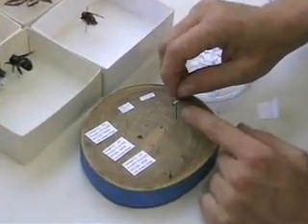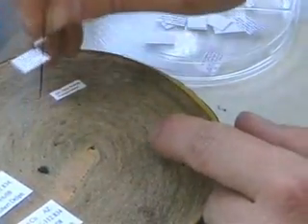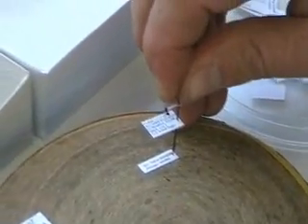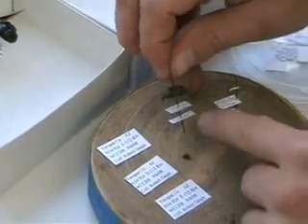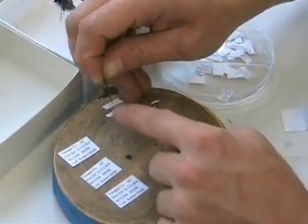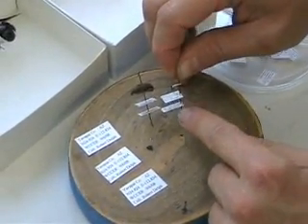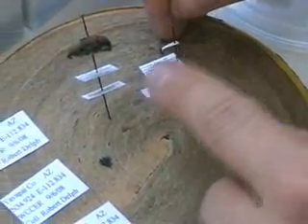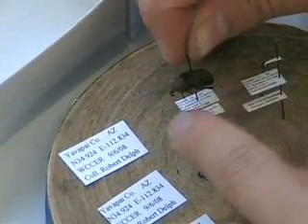This is a specimen on a point, so you have to pin the label a different way. You pin it on the right side of the label, and all the information reads from left to right lengthwise with the point. The same applies to the second label. With a pinned specimen, the information is in the center of the label reading left to right, head to abdomen. With a pointed specimen, labels are pinned on the right side reading left to right along the length of the point.